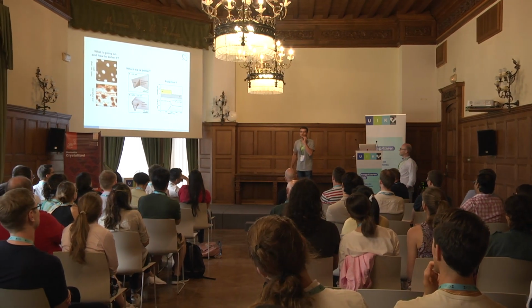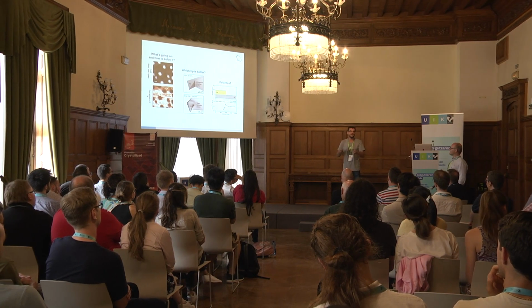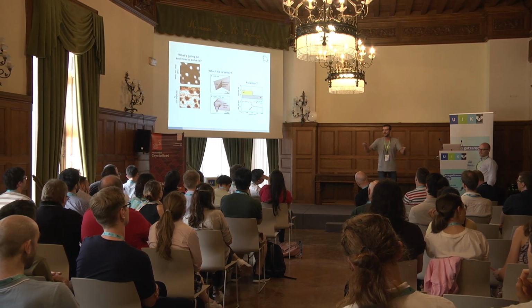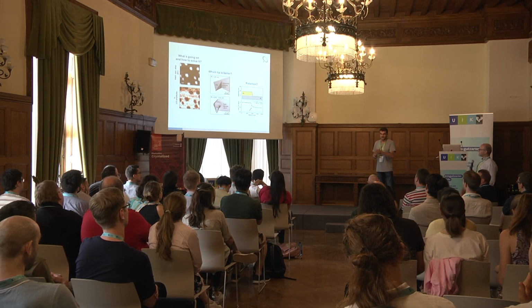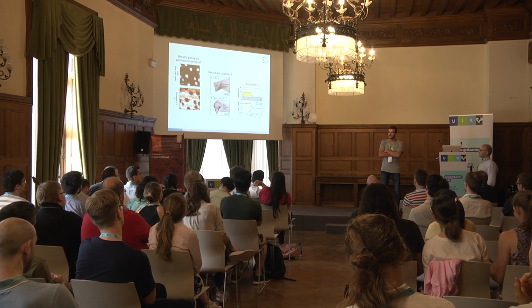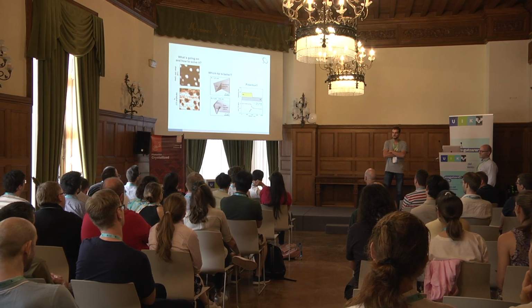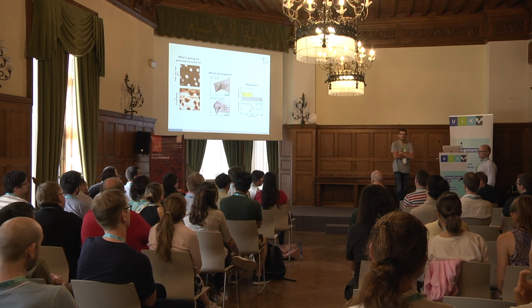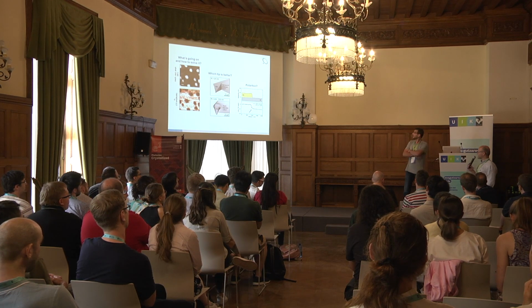Good. So let's assume we scan our standard samples, let's say we scan larger areas, like transistors or big patches of membranes. The answer is pretty okay, right? It's very good. My personal choice is the sharp tip, because sometimes if you have a very big tip, you can induce some other kind of effects in the tip due to the geometry. Mechanically speaking, I would go for the sharp one because then you control the distance from the sample.